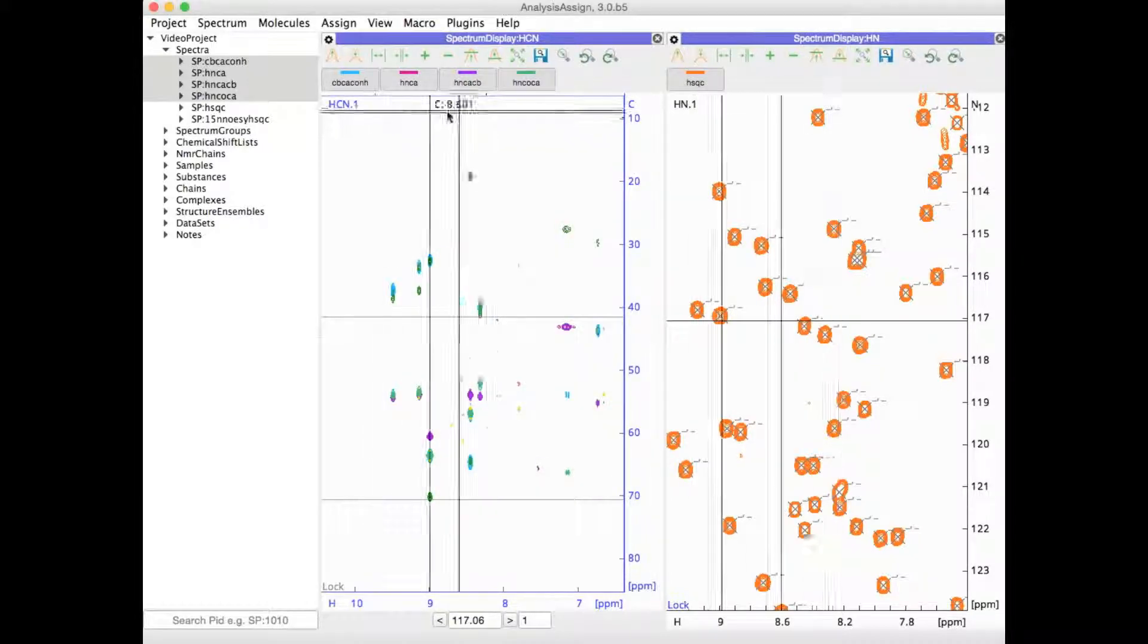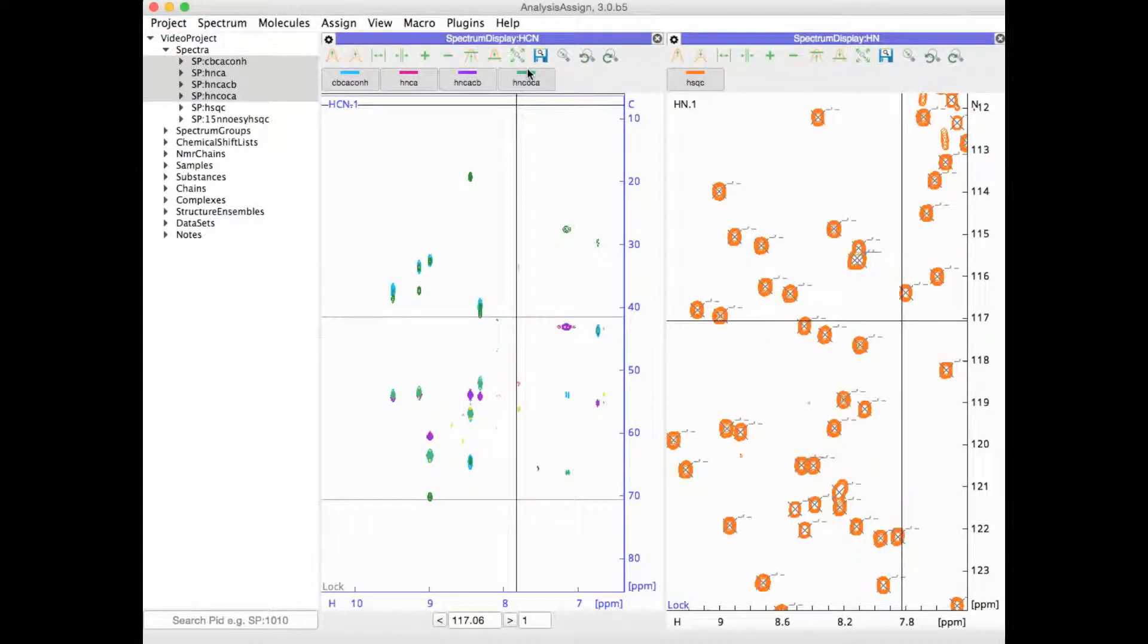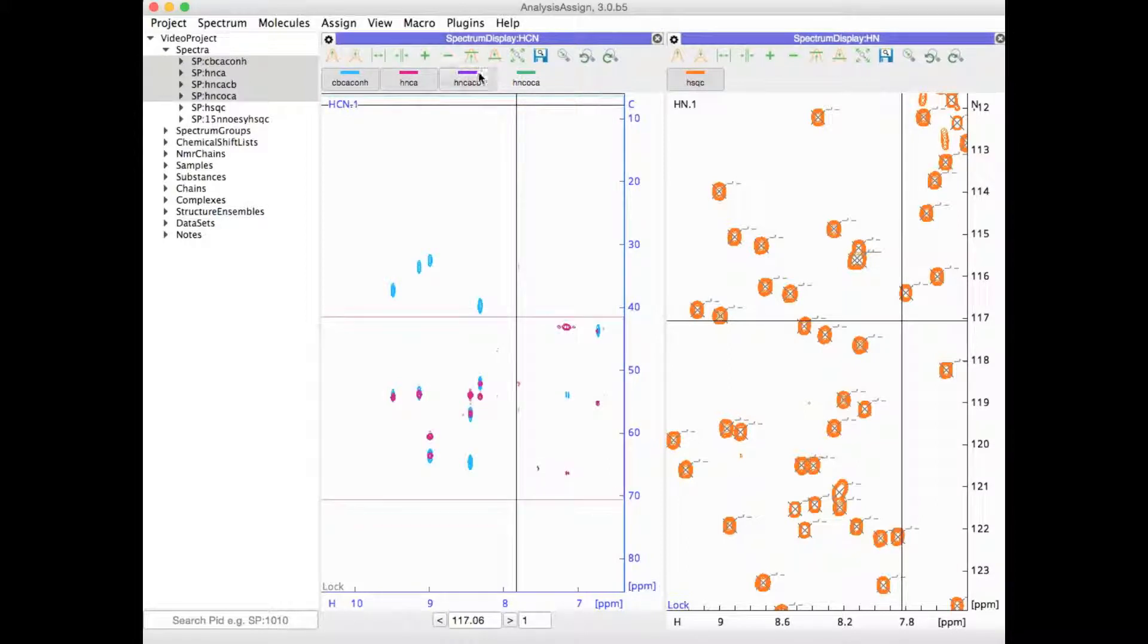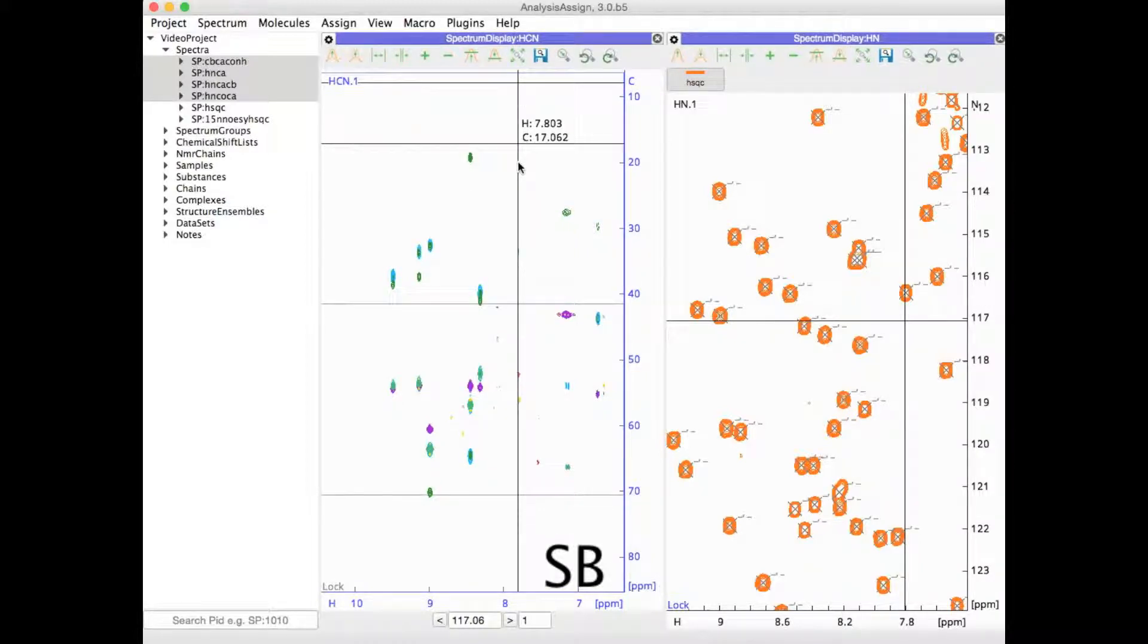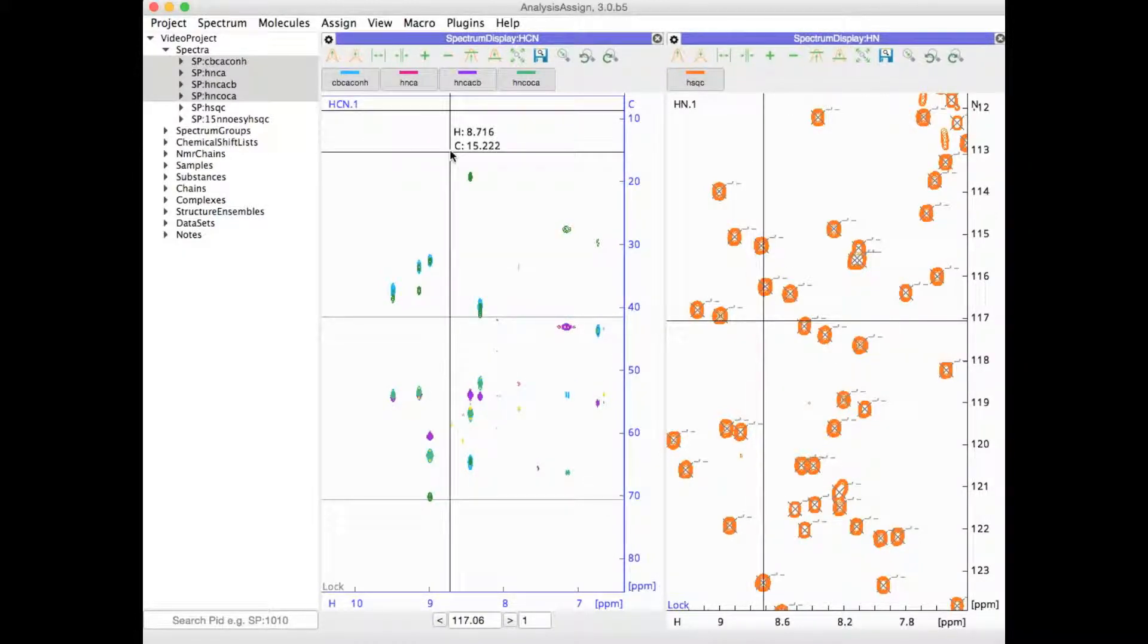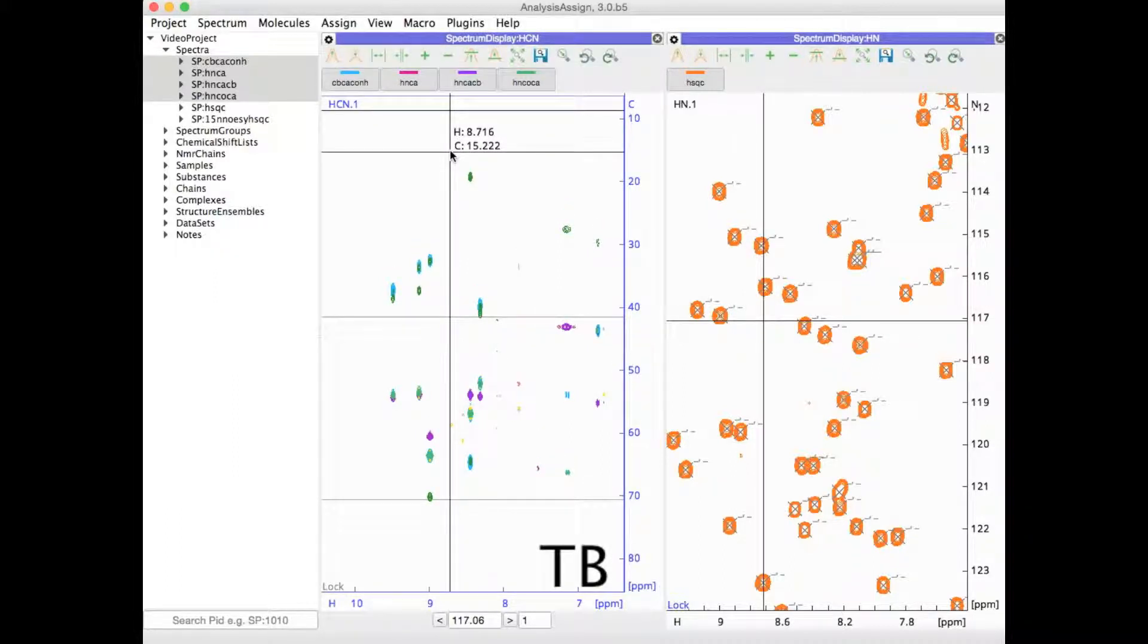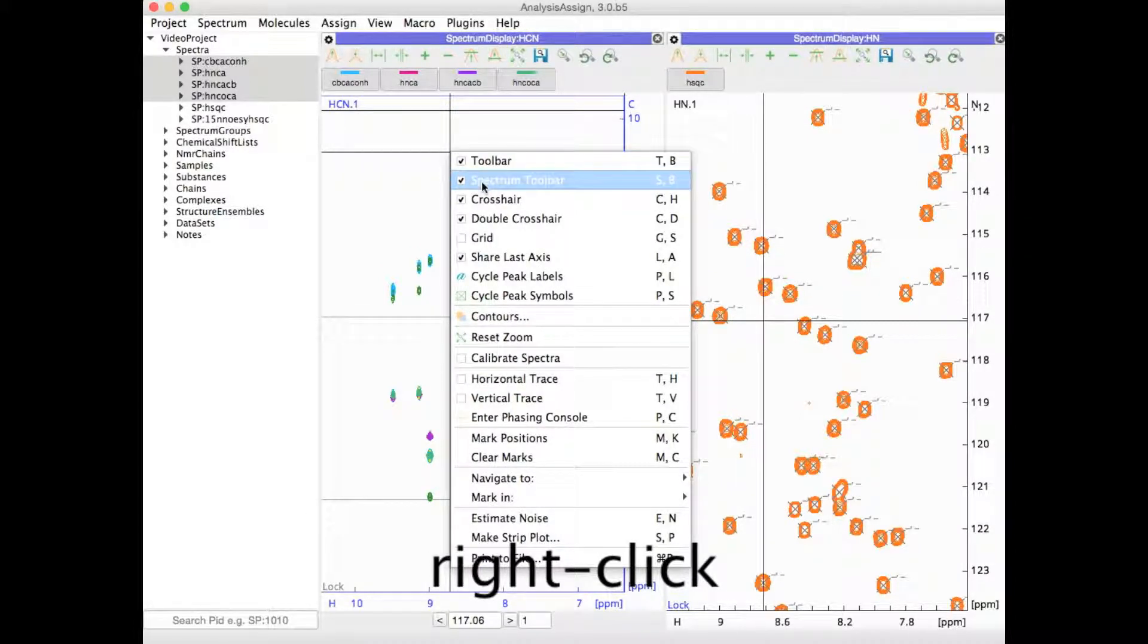If you have several spectra visible in one display you can switch these on and off using these buttons in the spectrum toolbar. You can toggle the spectrum toolbar on and off using SB and you can toggle the main toolbar on and off using TB. You can also access these through the right hand mouse menu.